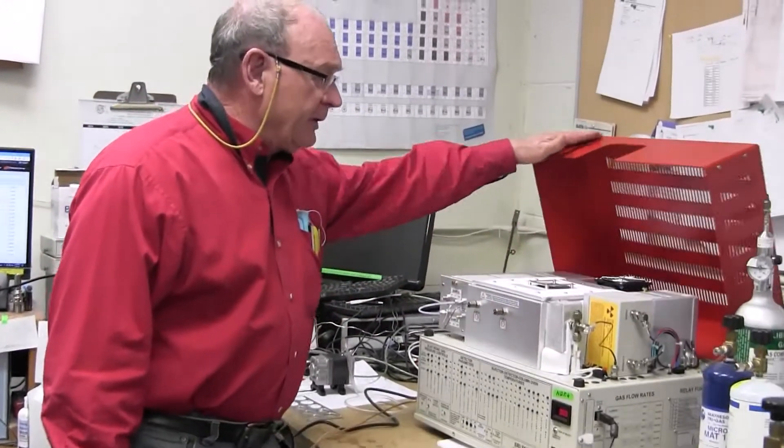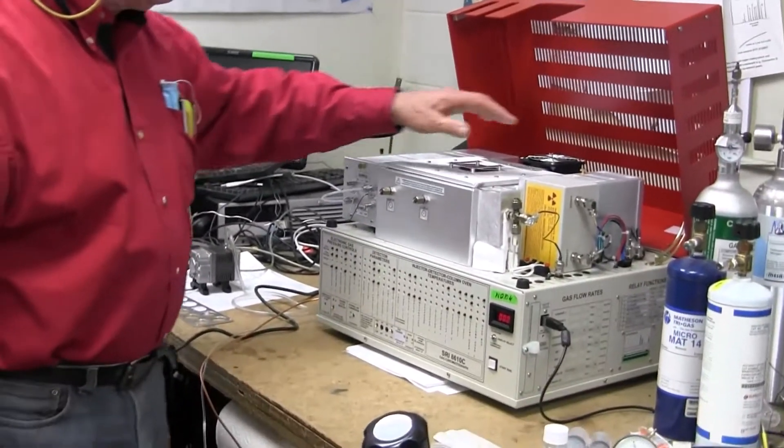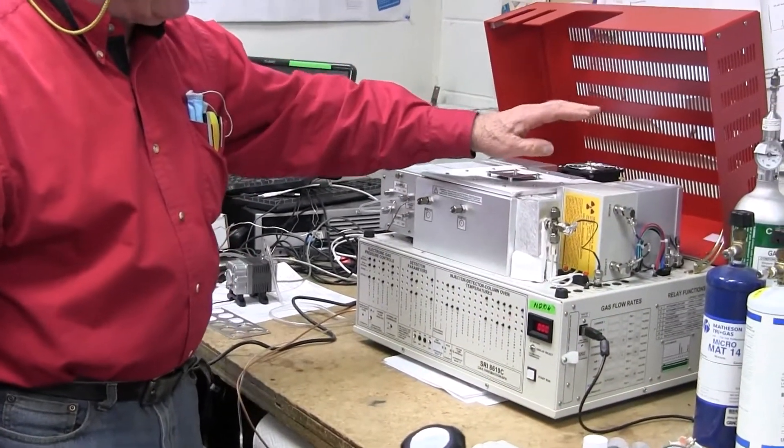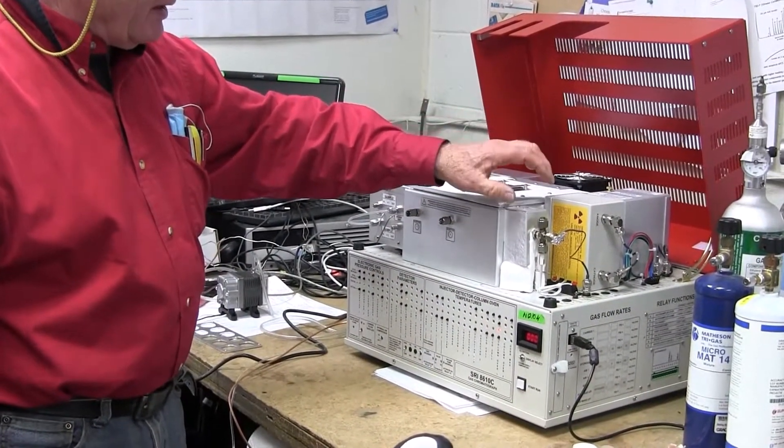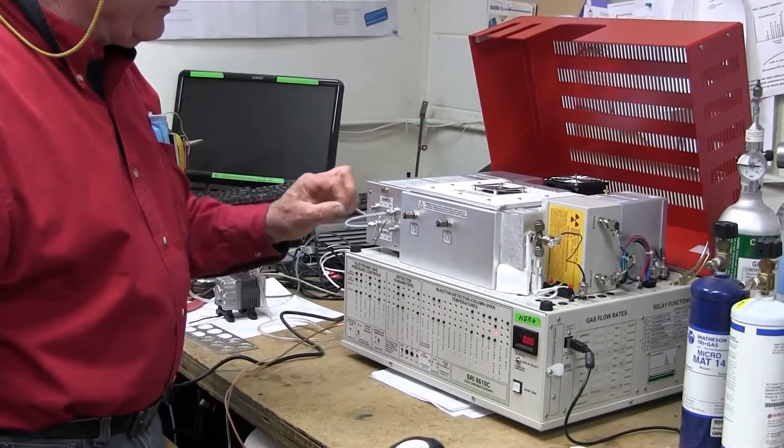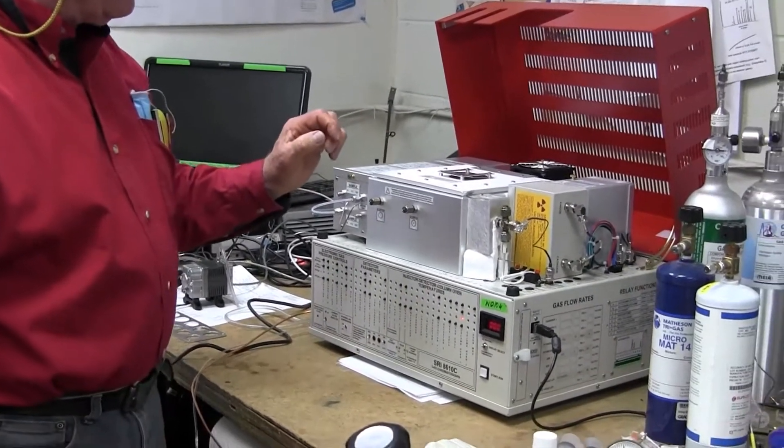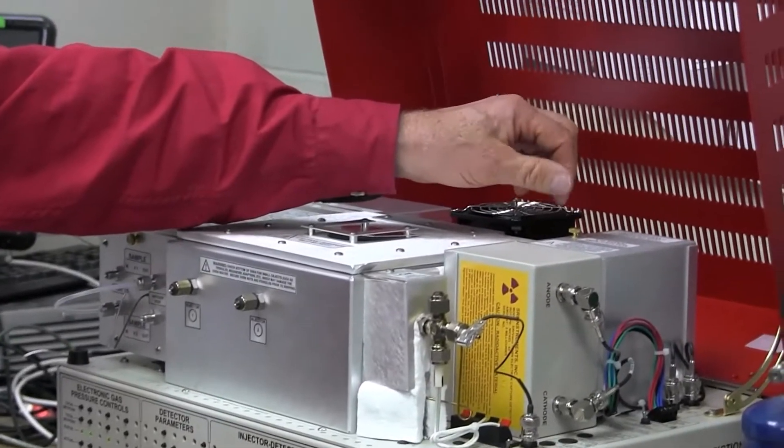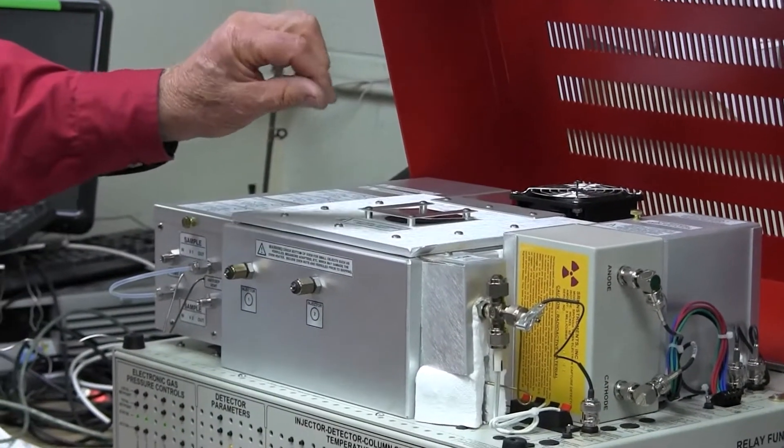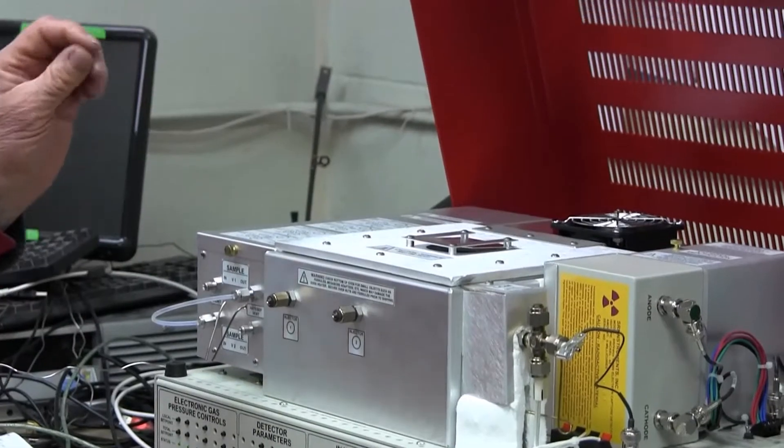This is a typical greenhouse gas GC configuration. There's an electron capture detector for detecting nitrous oxide and a FID with a methanizer for detecting methane and CO2. This particular one also has a thermal conductivity detector for detecting hydrogen, oxygen, and nitrogen at the same time.